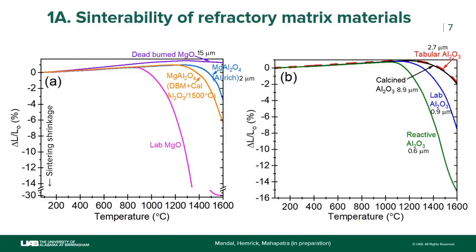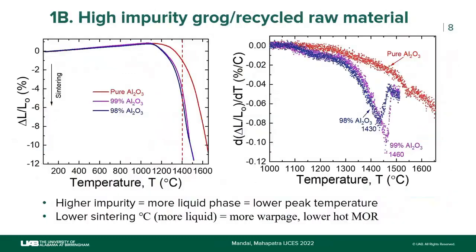So dilatometry can help you. Let's say you got this calcined alumina from some supplier and you see that it is inexpensive. Better run a dilatometer and see if it is matching your actual good quality material, say from Almatis, whether it is matching the actual material.